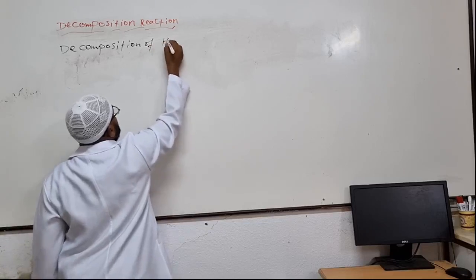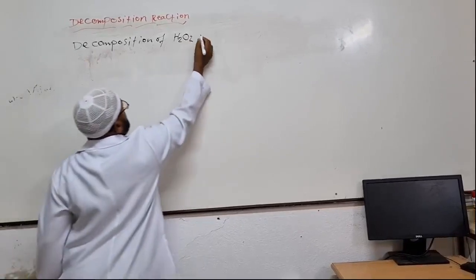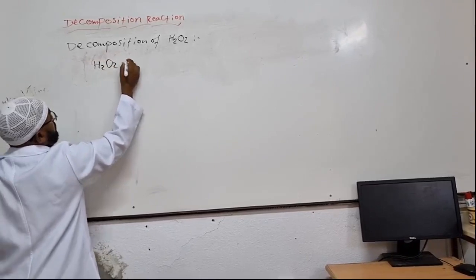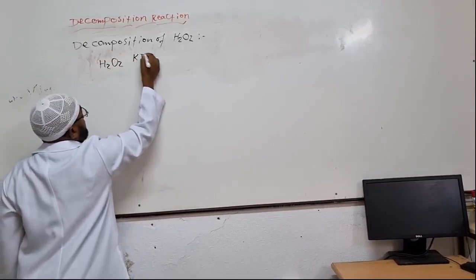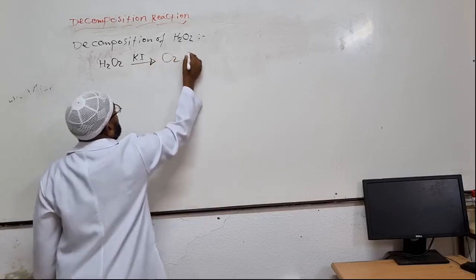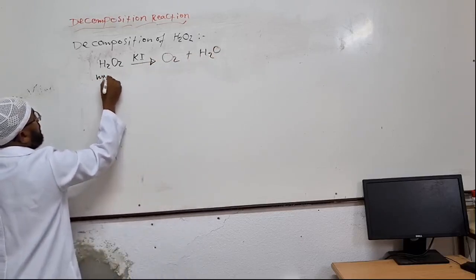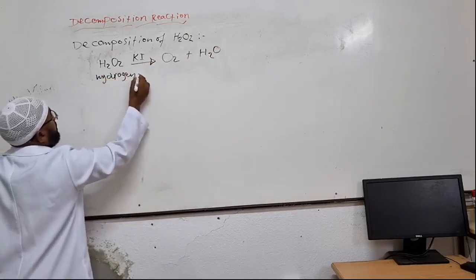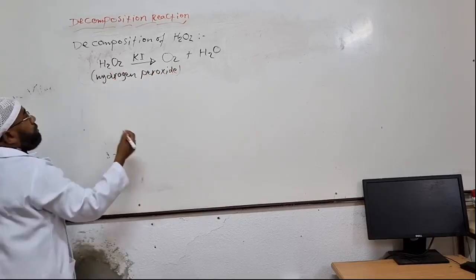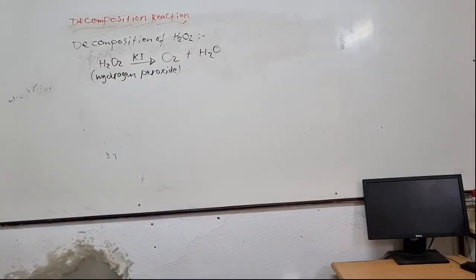Hydrogen peroxide, H2O2, with the help of a catalyst known as potassium iodide, gives water and O2.